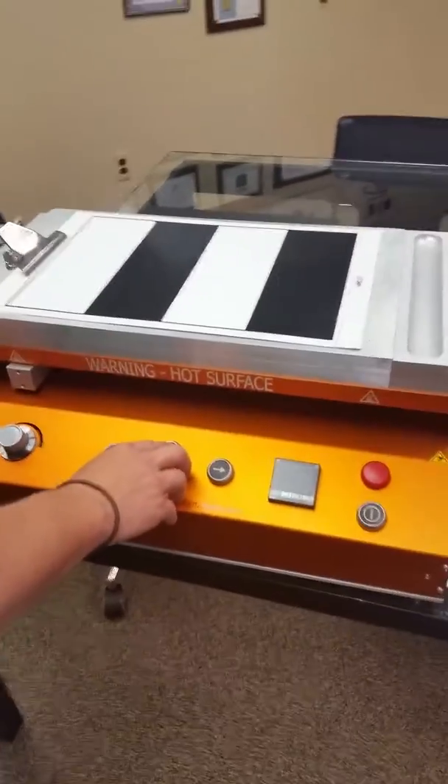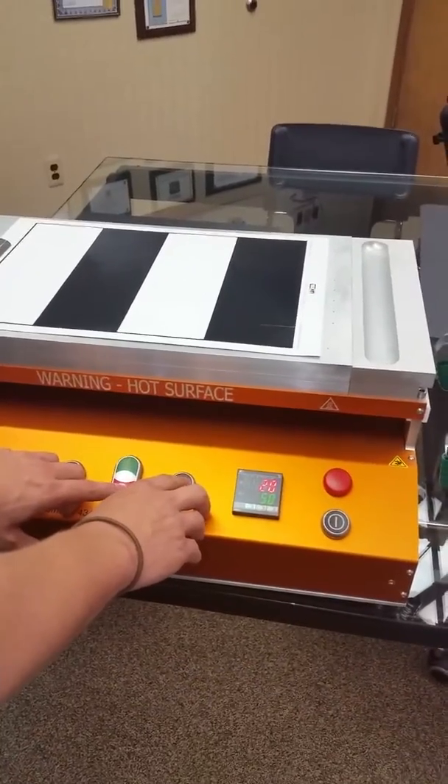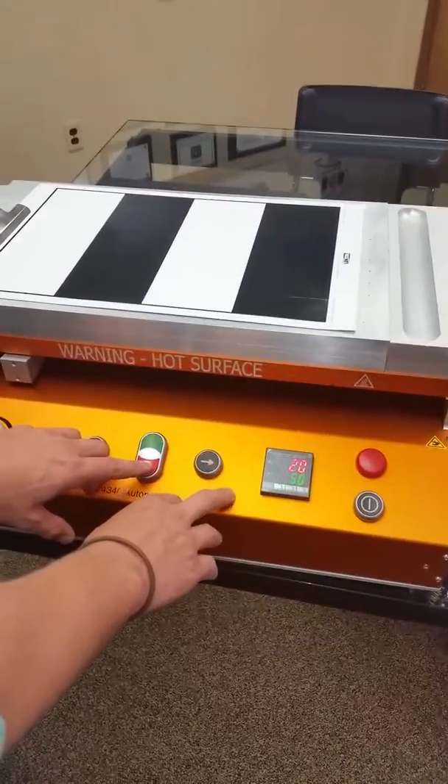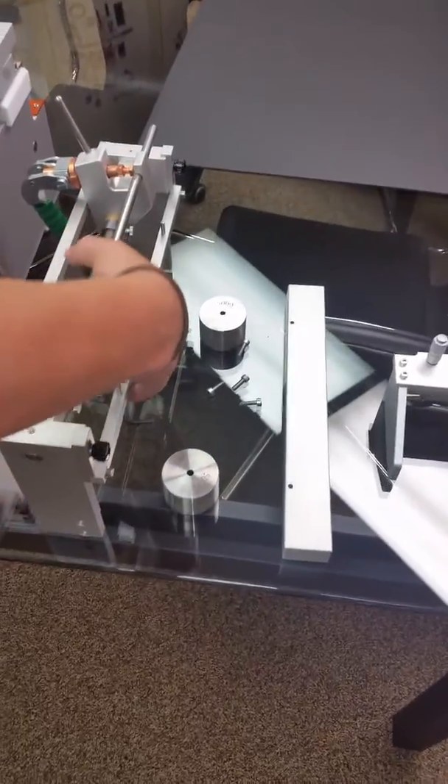This is the Elcometer 4340 Motorized Film Applicator. In this video, we're going to show how to attach the dual applicator attachment onto the table.